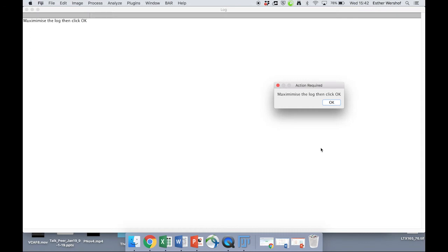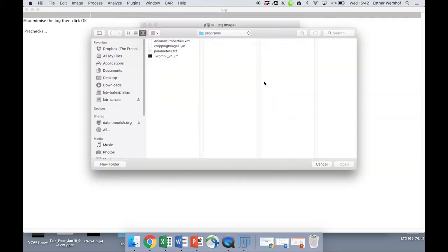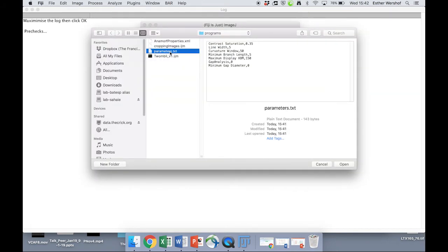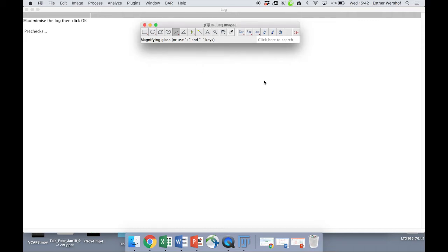So we're going to run Twombly again. It's asked us to maximize the log. Do we have a pre-existing parameter file? Well, now we do. So that's inside programs. These are the parameter values we just chose before, and we can come back to this at any time. It's just going to ask us again, are the matrix fibers dark on a light background? And they are.